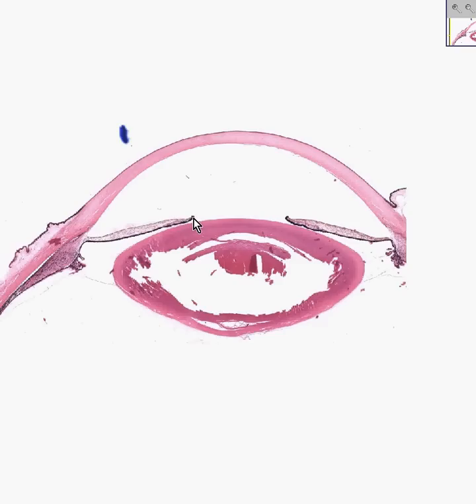Here is the pupil, which is the space between the two tips of the iris. Here is the iris. Here is the cornea. Here is the sclera. Here is the ciliary body. Here are ciliary processes.